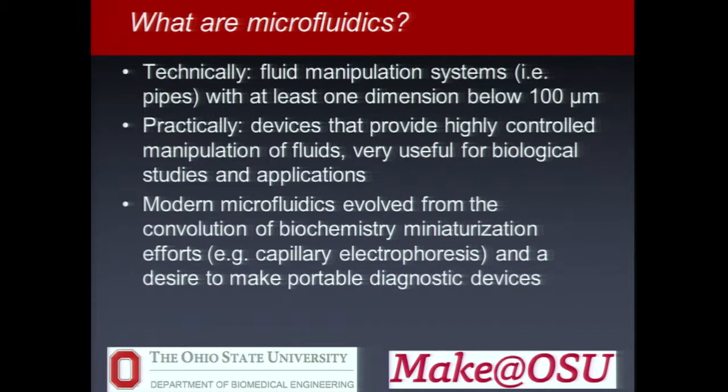So first, what are microfluidics? You may have heard the term. If you're not in the field, it's a bit of a confusing term. But basically, it's just a pipe that's at the micro scale. And that can really just be one dimension of the pipe is at the micron scale. But that changes a lot of the flow physics of any fluid moving through that. And so therefore, it becomes very important when we talk about how fluid behaves as you're pushing it through. And so practically, it's really just a way of making structures that we have very controlled flow, and we can control how the liquid moves around.